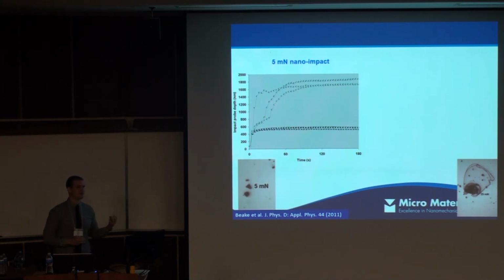What is interesting, so this is just a larger slide of one of those. So this is the 5 millinewton impact accelerating force. So you see there's a clear difference between coatings which behave very well in this, so you get that initial surface damage, then a fatigue period with no failure, to some of the other coatings which showed very dramatic failures during these 5 millinewton tests.